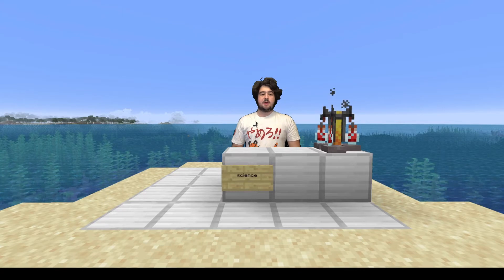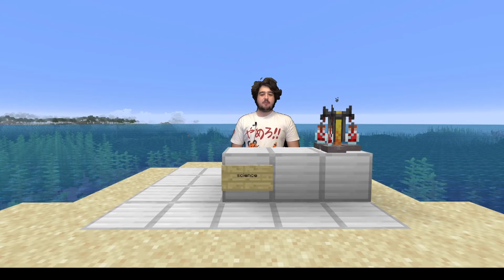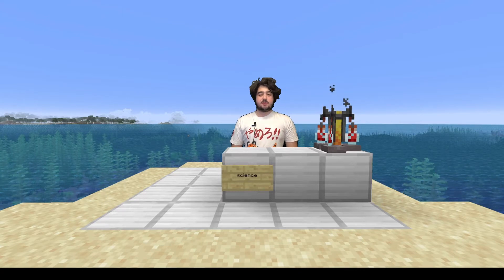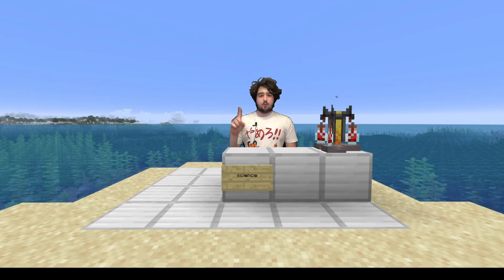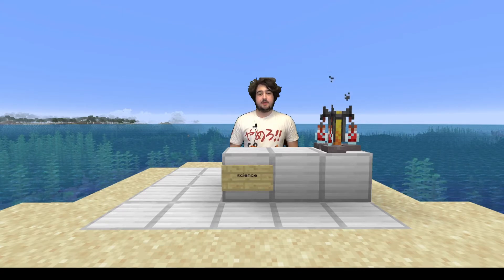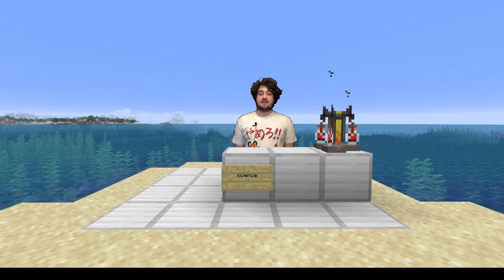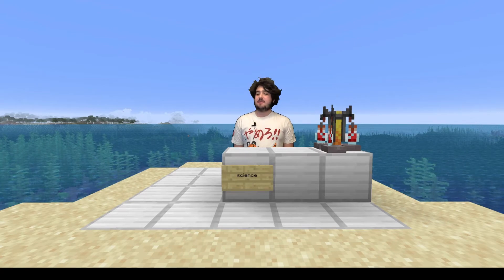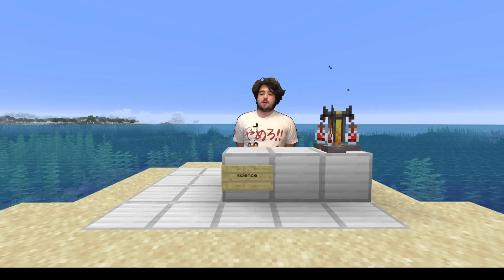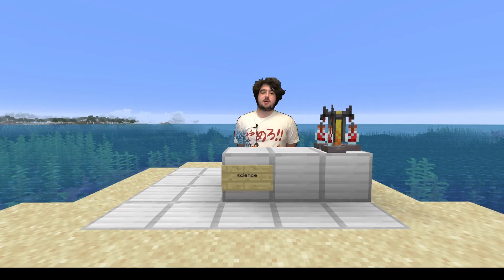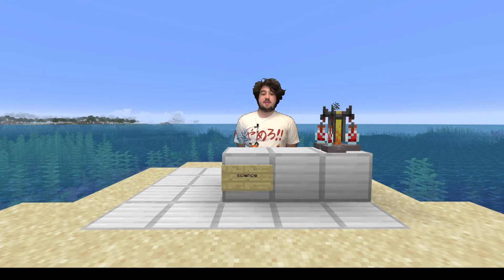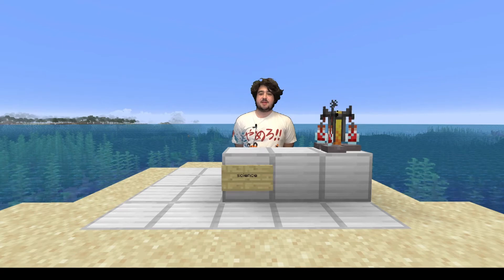Hello gamers and gamettes, welcome to my laboratory where safety is number one priority. Today we're going to be discussing lab safety. Without further ado, let's start by looking at some safety symbols that you may see in the laboratory.